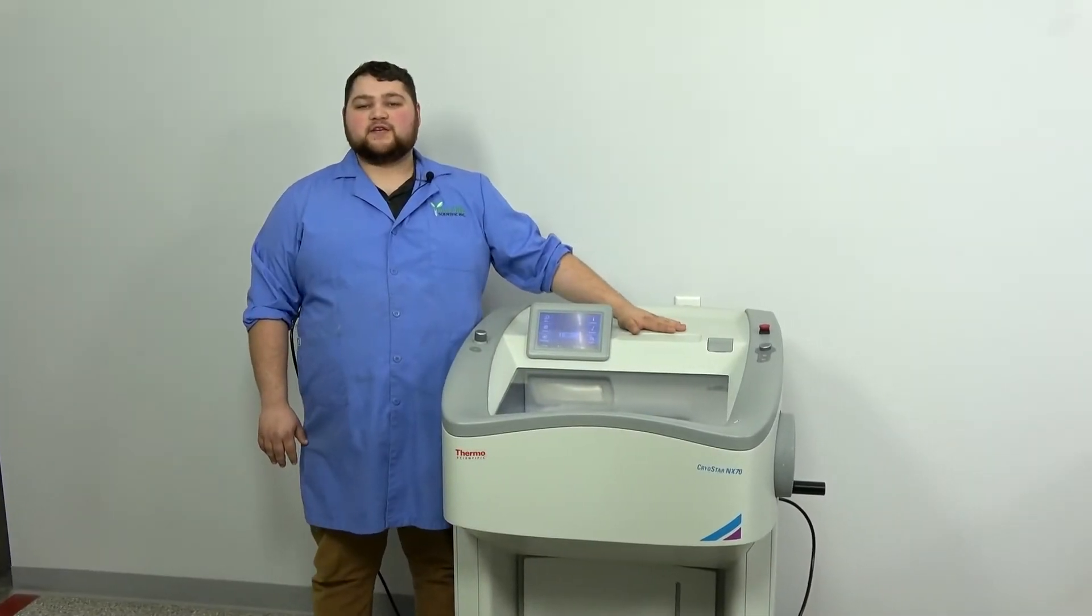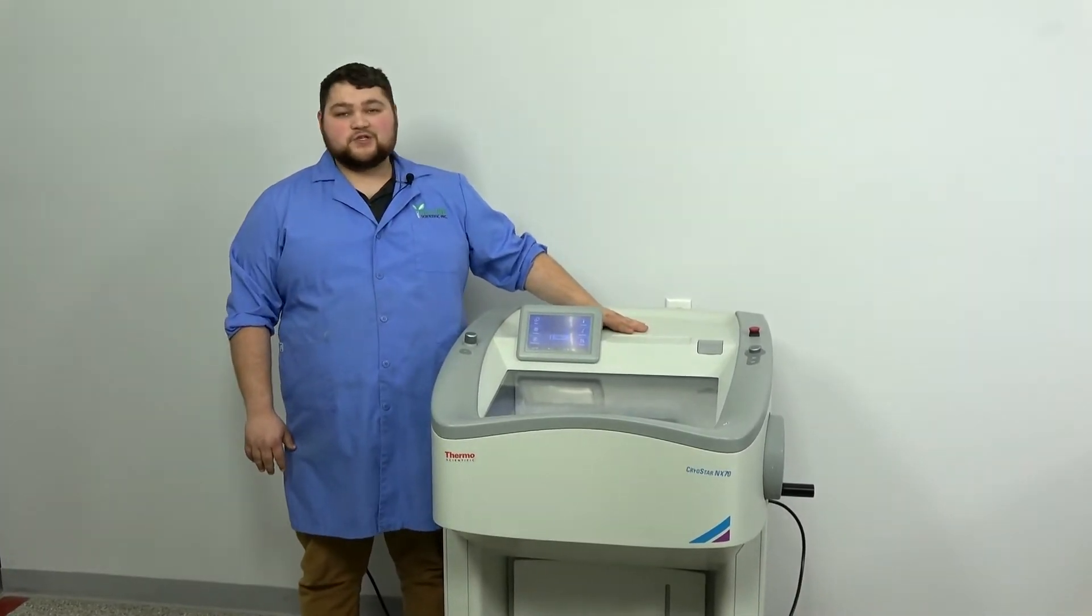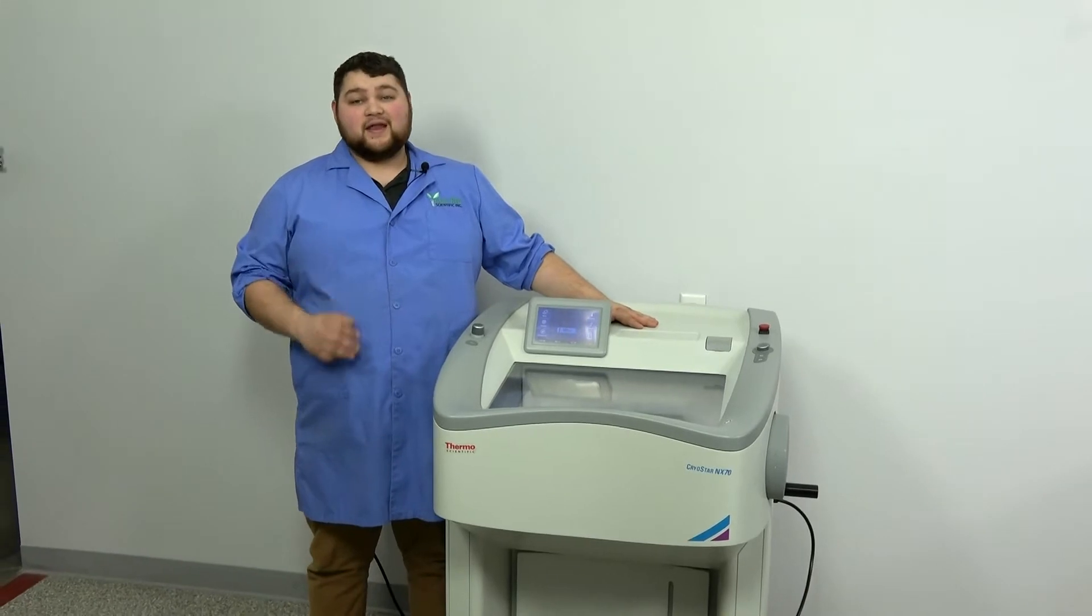Hi, this is Robert with New Life Scientific here to show you some neat features on this 2012 NX70.